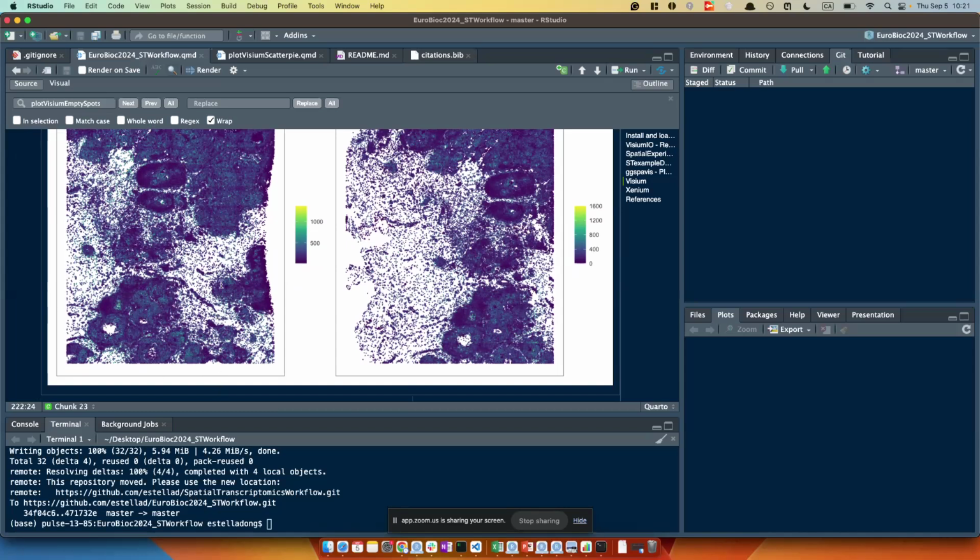Why is it like this? I think this is some error by the, not biologists, sorry, by the people who generate the data. So there are some tools to do that, to register. STalign, for example, that's a Python tool. SpatialData, I think, automatically handles that.